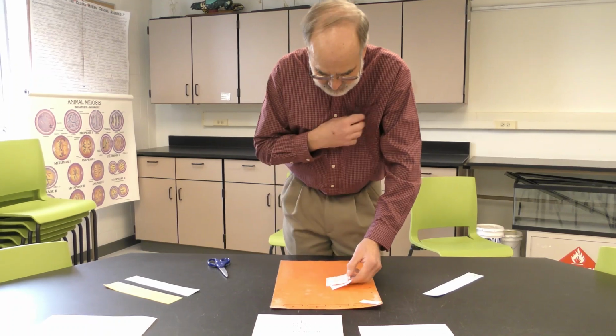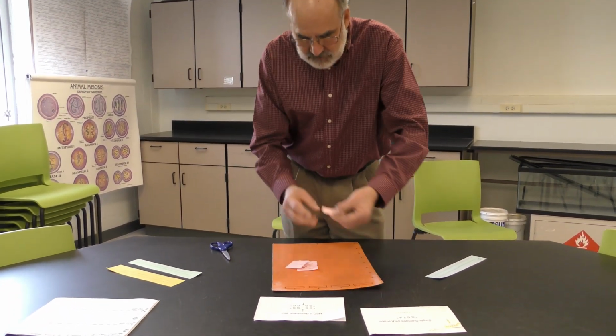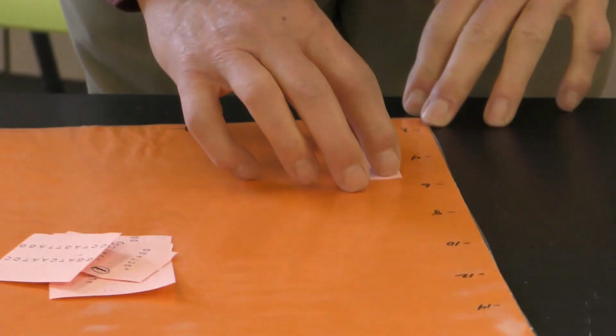Now, it might be helpful when you do this exercise. What you're going to do is count the number of base pairs. And you can just simply count across the top if you want to know, 1, 2, 3, 4. There's 4 base pairs represented in that fragment, and that would migrate down to essentially the 4 position on the gel. Then you would go along and count up all the number of base pairs in each one of these.